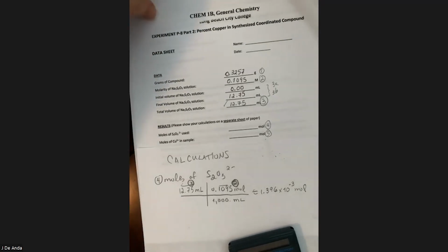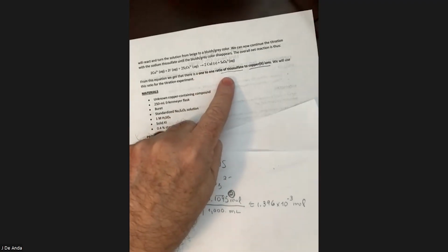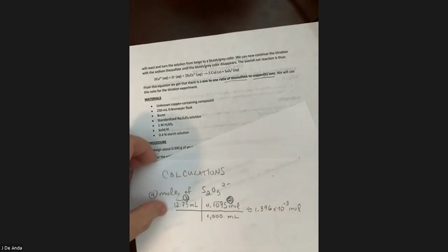Remember that our main thing here, let me go back to the procedures here. Remember we said that there is a ratio of 1 mole of thiosulfate reacted for 1 mole of copper 2 ions in our sample.